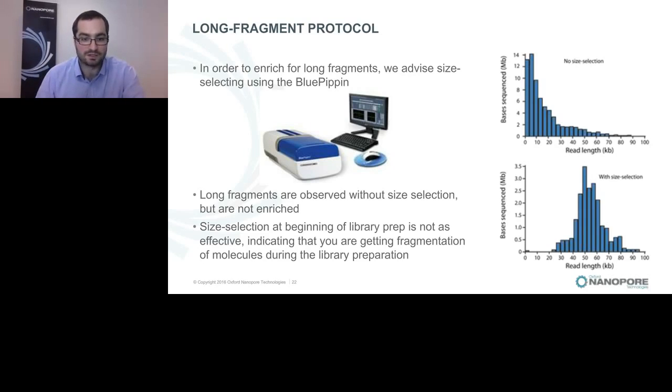The protocol, which should be released soon if it hasn't already, allows the user to achieve almost exclusively long fragments. The size selection is done as virtually the last step. It's done after the ligation of the adapters. We do it this way so as to minimize manipulation of the sample after the size selection.